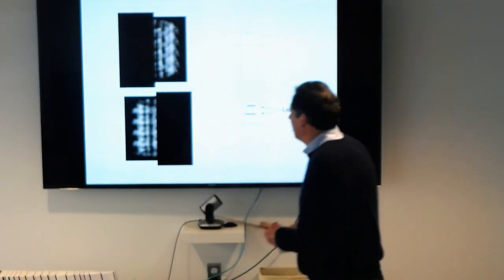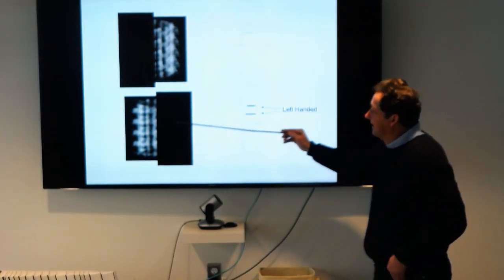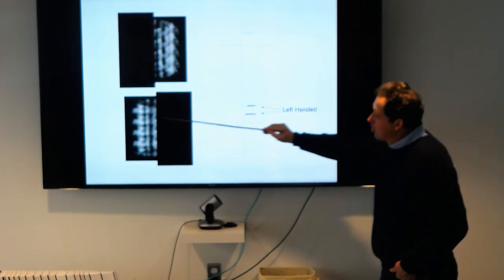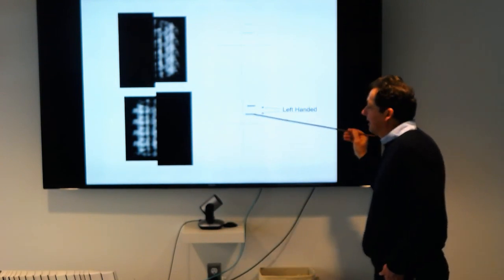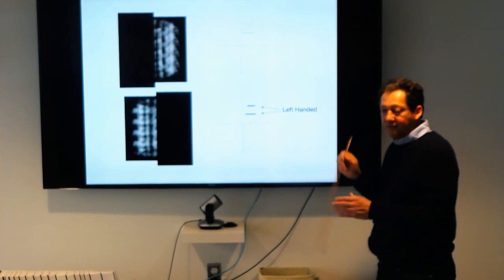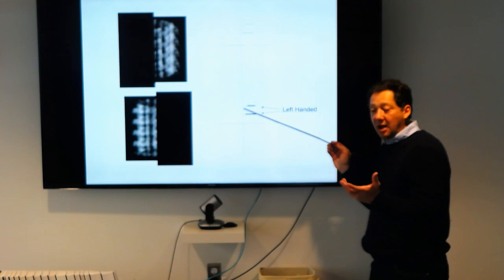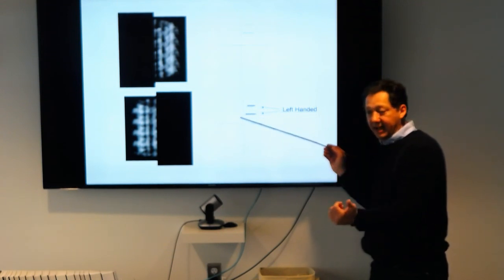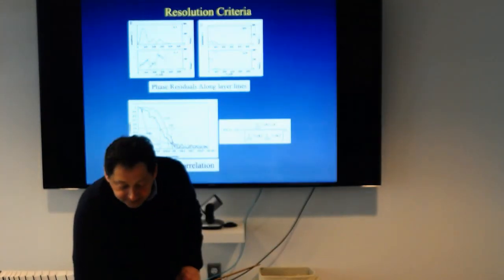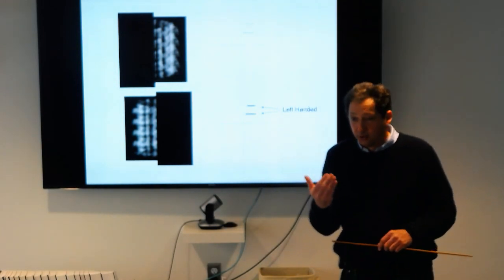This tilting, you can also mix it with the diffraction pattern, and actually you're going to see that when you tilt it, some spots are going to become stronger at this layer line. So you will identify this Bessel order right there on your diffraction pattern. And if you know the direction of tilt, you know, oh, these are positive n, and that will help you to determine the n. You don't have to do this for every single layer line. You have a selection rule that has to fit.